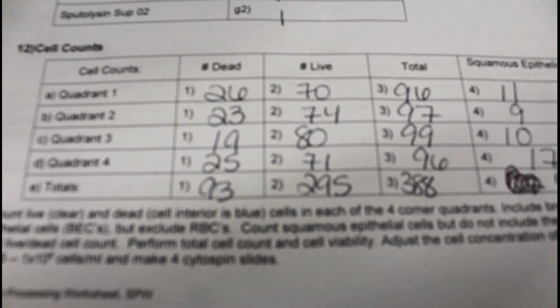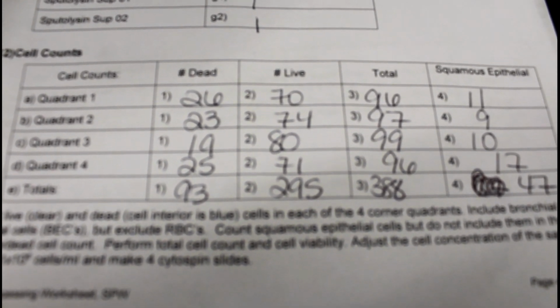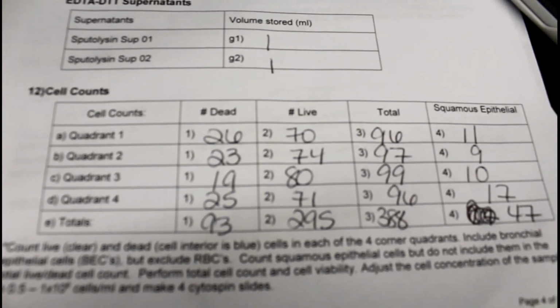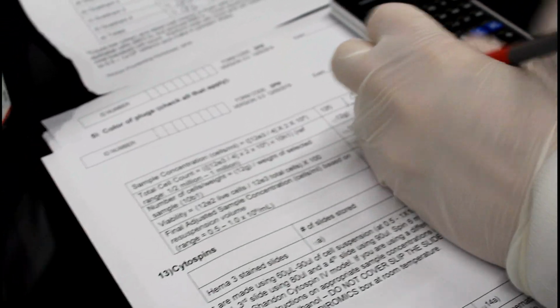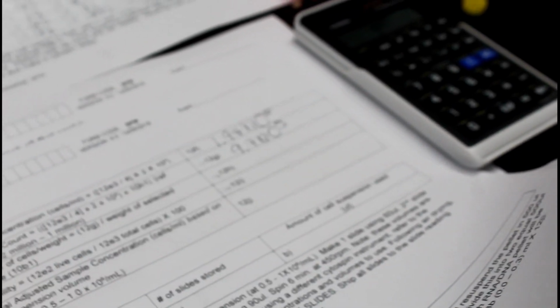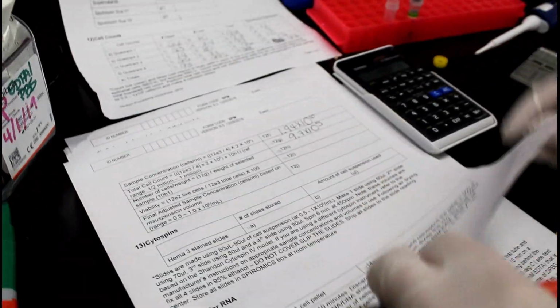After you've finished your counting on the microscope, you'll fill in the table with your cell counts. Again, remember to include both the dead and live cells, as well as the squamous epithelial cells. Once you have those numbers recorded, you can perform the total cell count and the cell viability. Total cell count is performed by taking the sum of the 4 grids, dividing that number by 4, multiplying that by 2, and then multiplying that by 10,000.